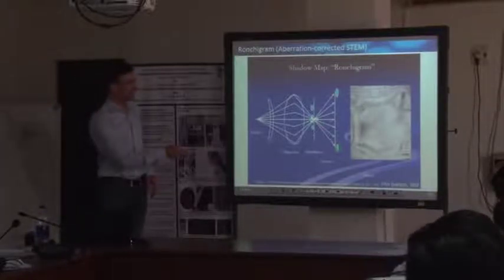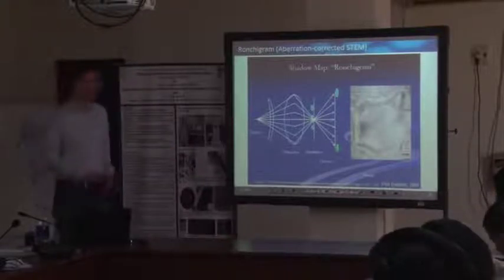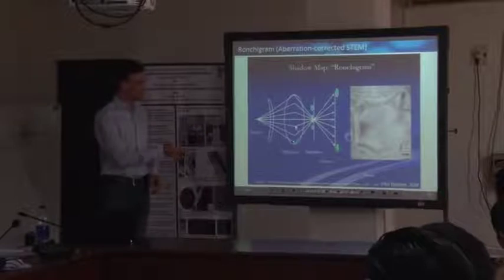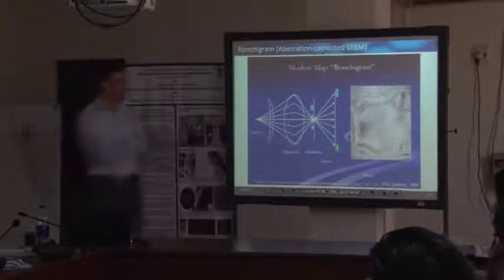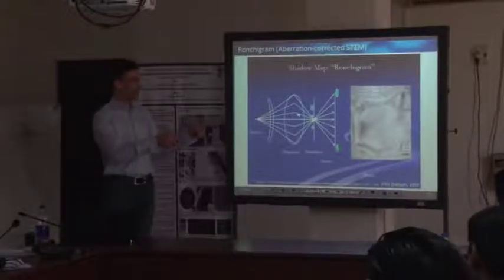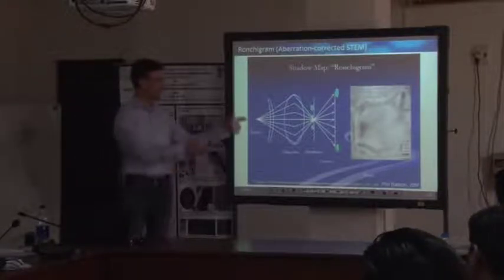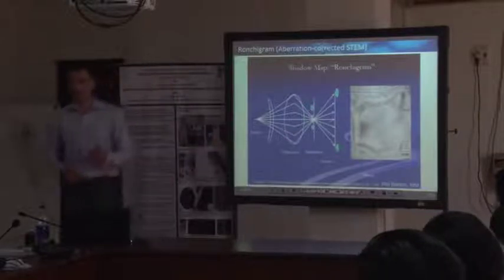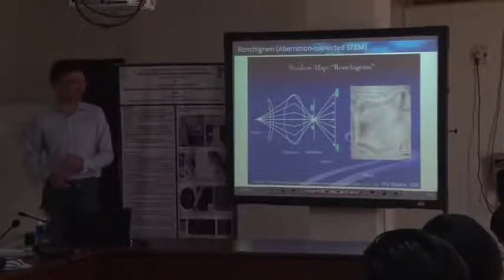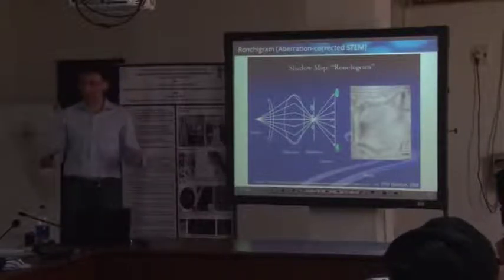This is the case when you focus your aberration corrected probe on the sample. It means that we are able to accept many more contributions towards larger angles through our optical system, through our objective lens. This is why we are able, in principle, to realize a far stronger beam with an even smaller size on our sample. And here, we can just use a larger aperture.